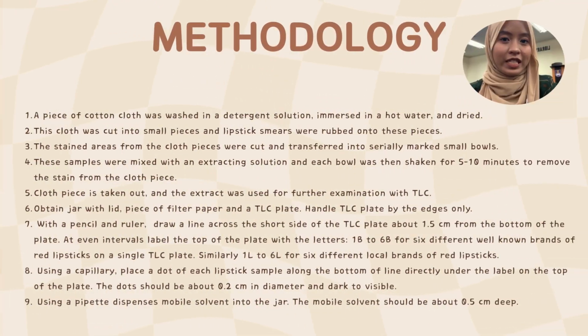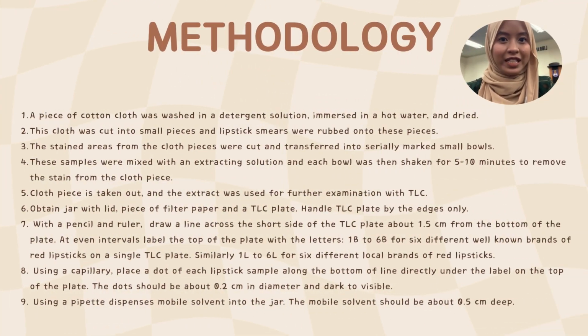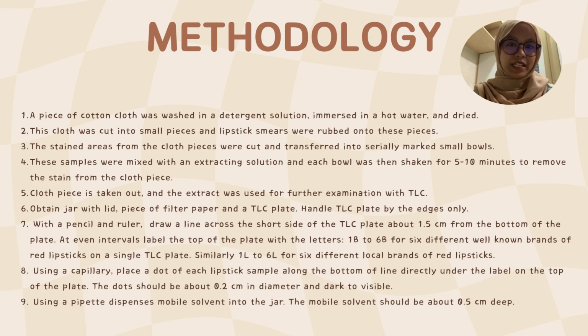Hi, my name is Nur Nafisa, and I will explain about the methodology. This is an example experiment about comparison of red pigment on different lipsticks that use TLC chromatography.